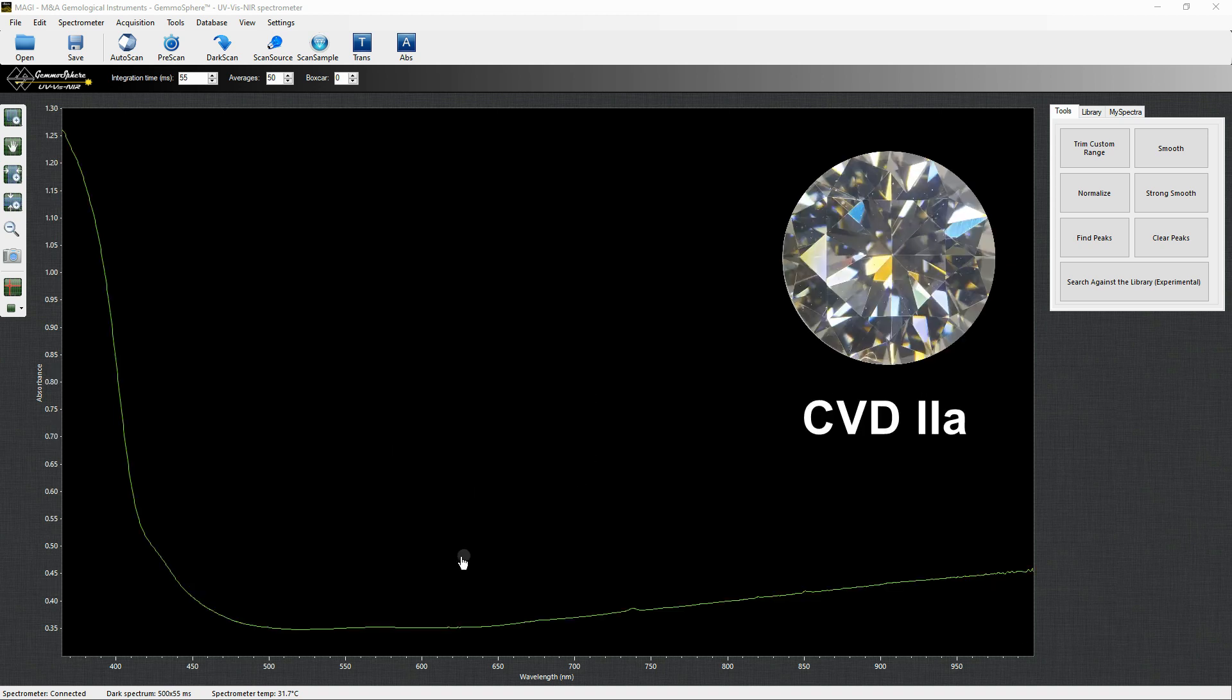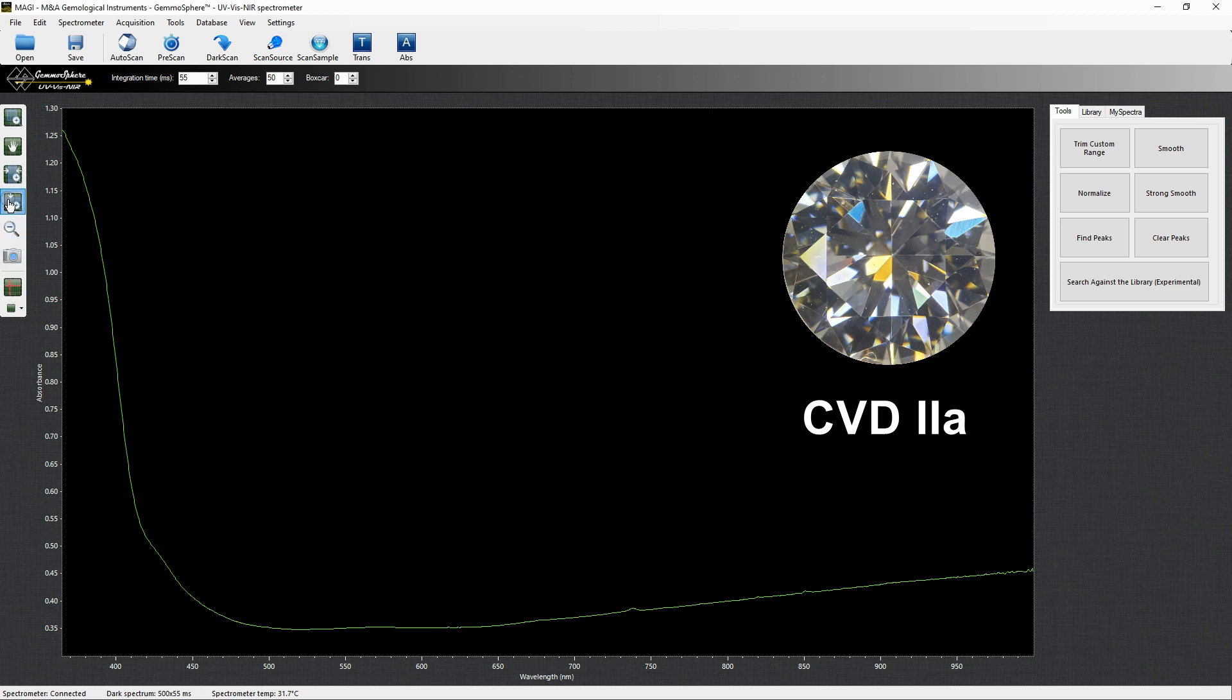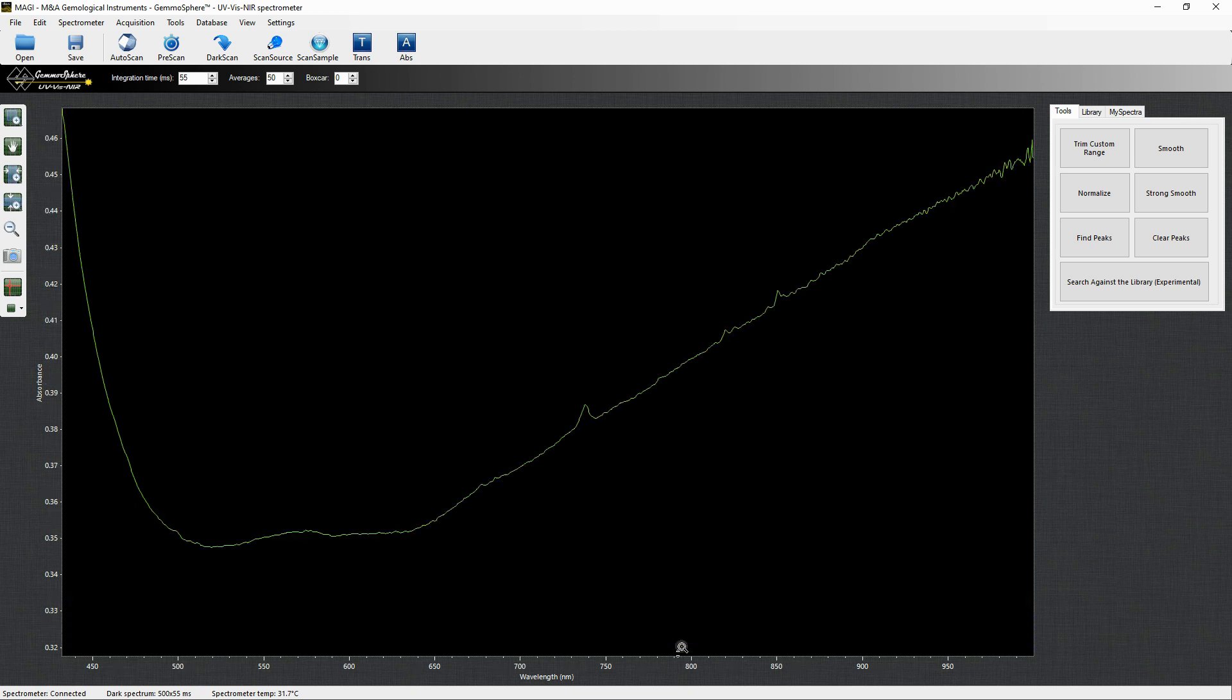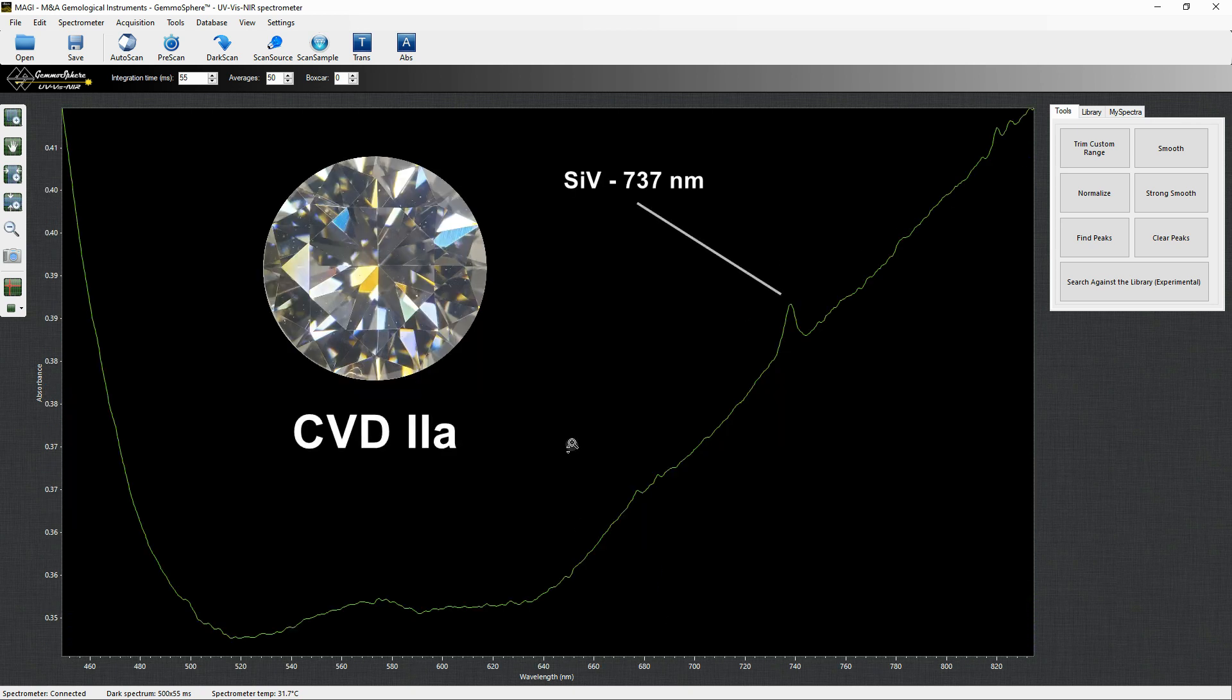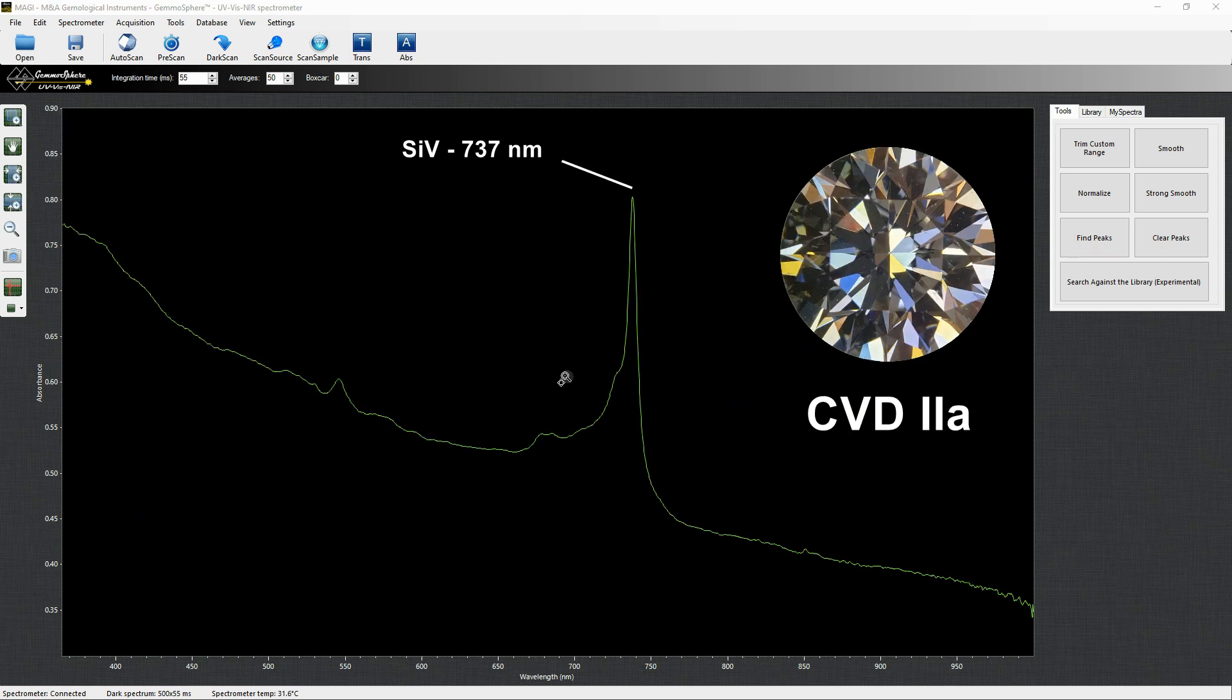Many samples of CVD feature a lattice defect due to silicon contamination causing an absorption peak at 737 nm. Although this defect can be rarely seen in a UV-Visnir absorption spectrum, when it's present it is a very good indicator the diamond is a synthetic CVD. This sample shows an extraordinary level of silicon contamination.